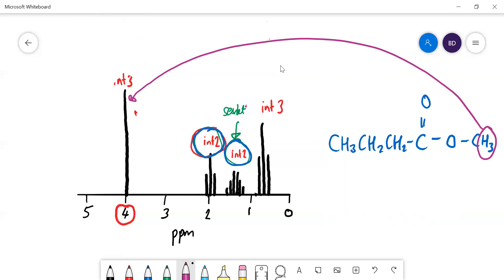This one here is this one here, and that's a triplet because it's next to a CH2. This one here, that's the sextet because it's in the middle of carbon 1 with 3, 1 with 2. A lot of splitting there. And finally, we've got those ones which are triplet, split into a triplet. And they've got a ppm about 2 because it's next door to a carbonyl group.